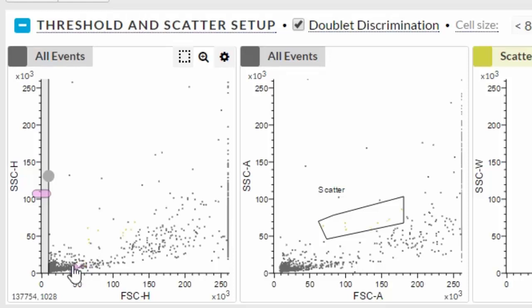To set the threshold, move the gray circle across the screen like a window shade. The threshold can only be set on the first default plot.